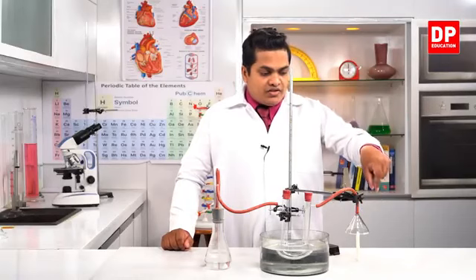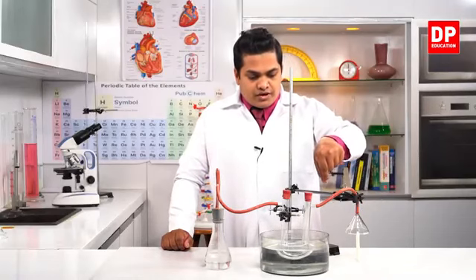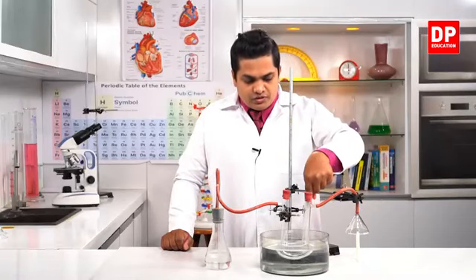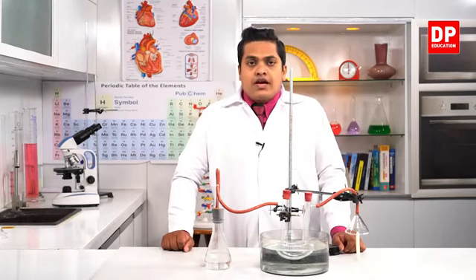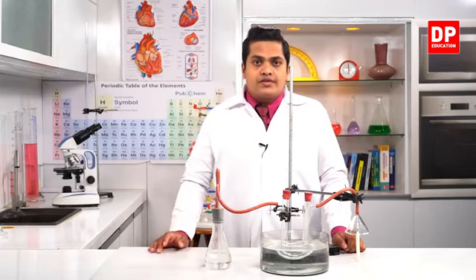The smoke which is coming from the delivery tube goes through this arm of the U tube and travels to the other arm of the apparatus.